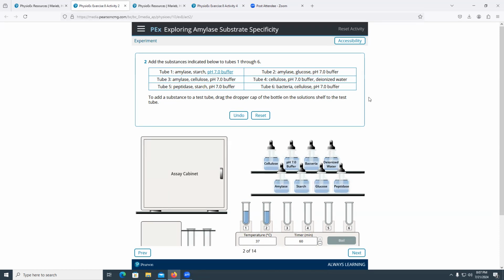And that means the Benedict reaction is going to detect for me that there is a lot of glucose. But in 1, we're going to be seeing very little. In the IKI, we should see a little bit of that natural color because everything has been converted into products. And we should see very heavy, reddish color because we have really become converted into products.